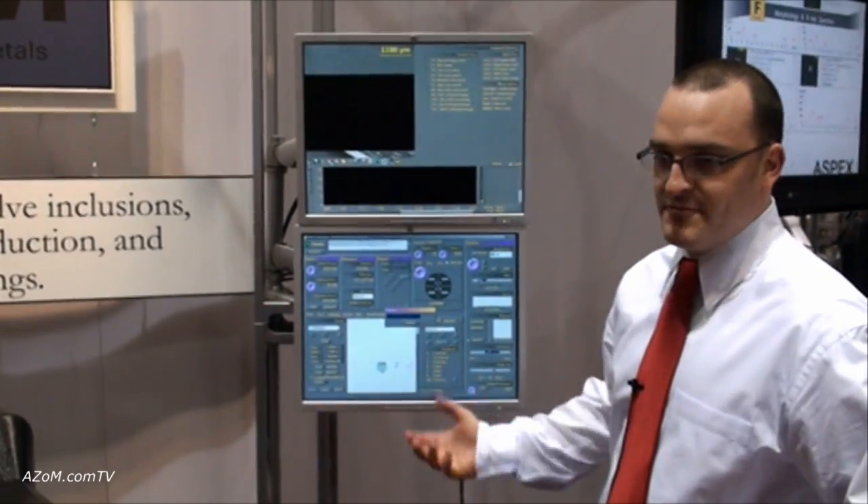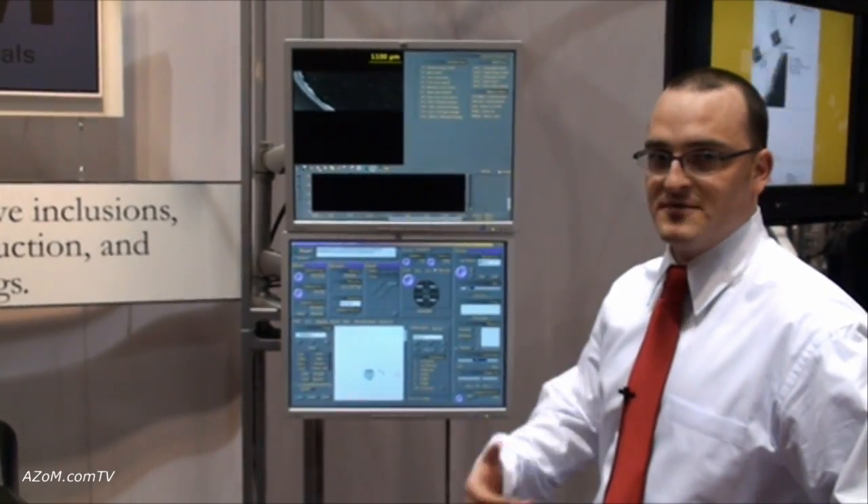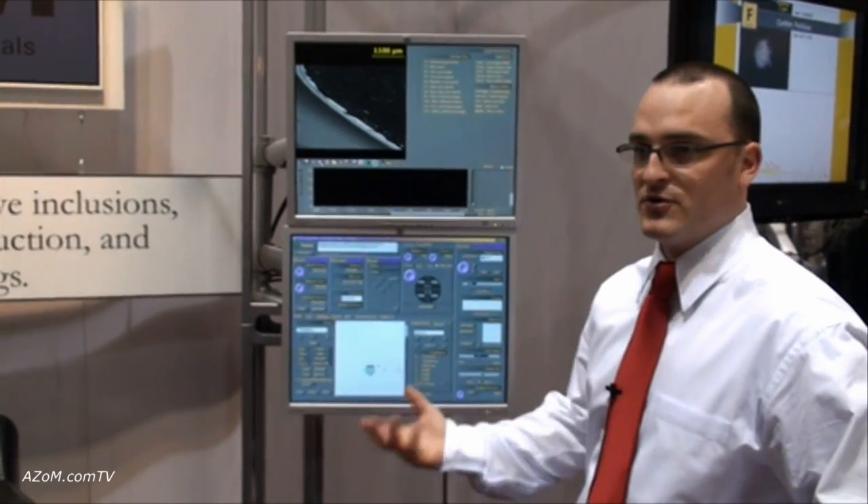While it moves to that position, in this case we have a sample with several different types of stainless steel particles as well as copper and nickel particles.